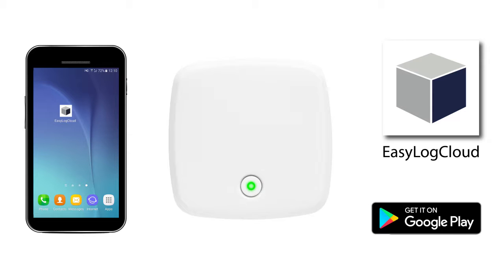Before opening your app, make sure your mobile data is disabled and you are connected to Wi-Fi on your smartphone.